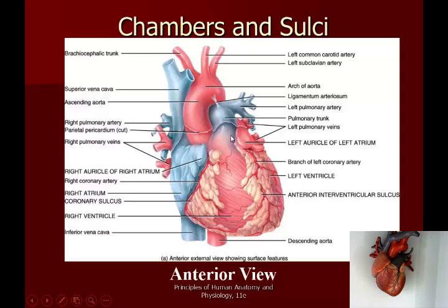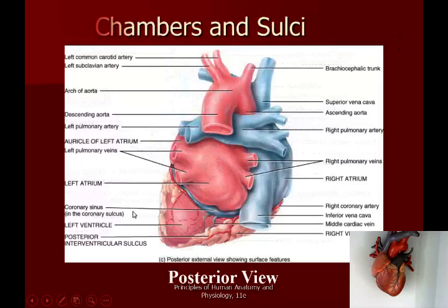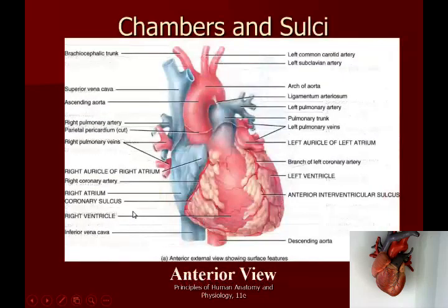So it comes across here, and then here, I can do a little drawing, if you will. It's going to end up snaking across, and then it branches really, really quickly into the anterior interventricular artery, or the branch, and then the circumflex as it goes across there.